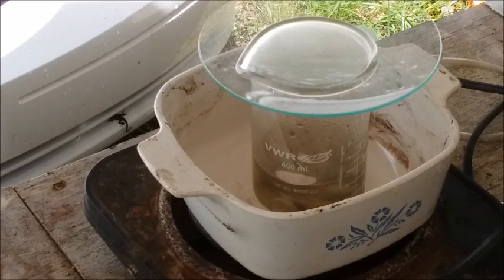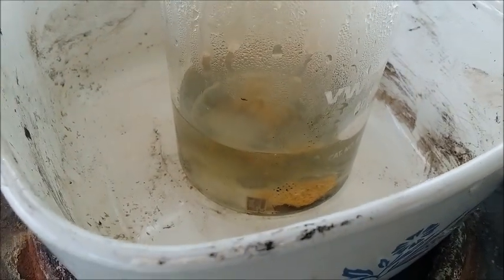So I'll let this go. And when it's done, I'll decant it off and then rinse everything. We'll be ready for aqua regia. And I'll show you what this looks like in a little while. Okay, this is heated up.